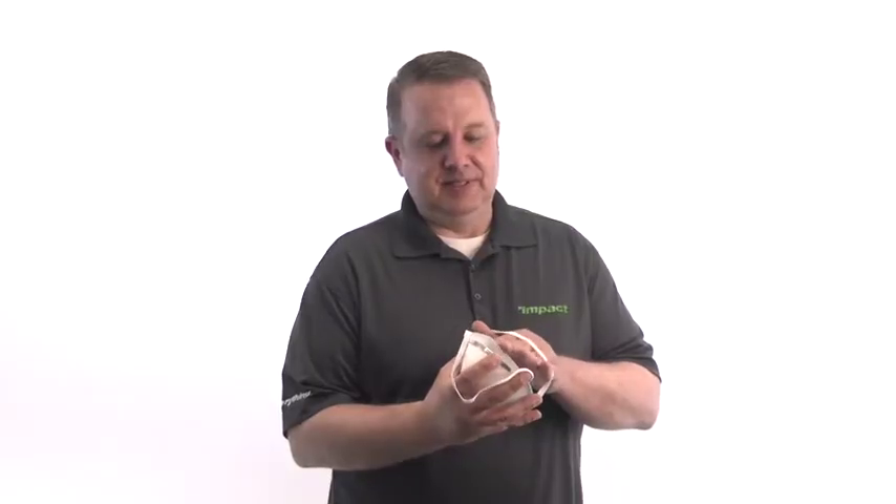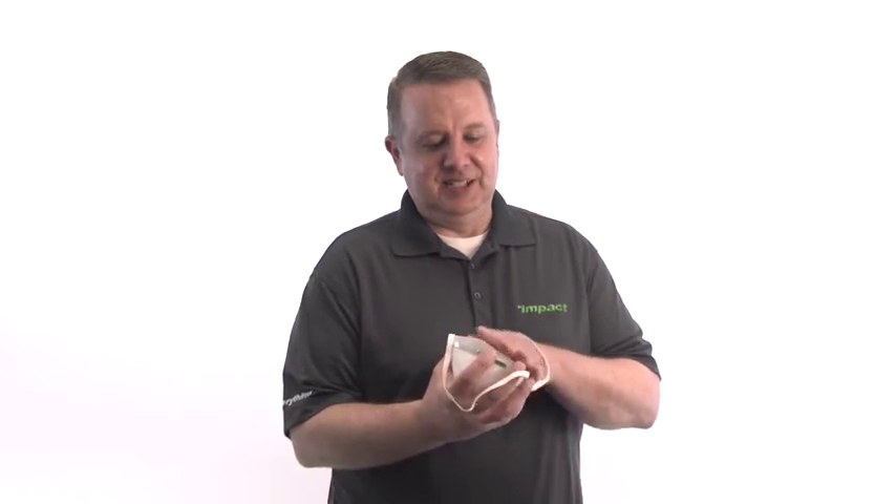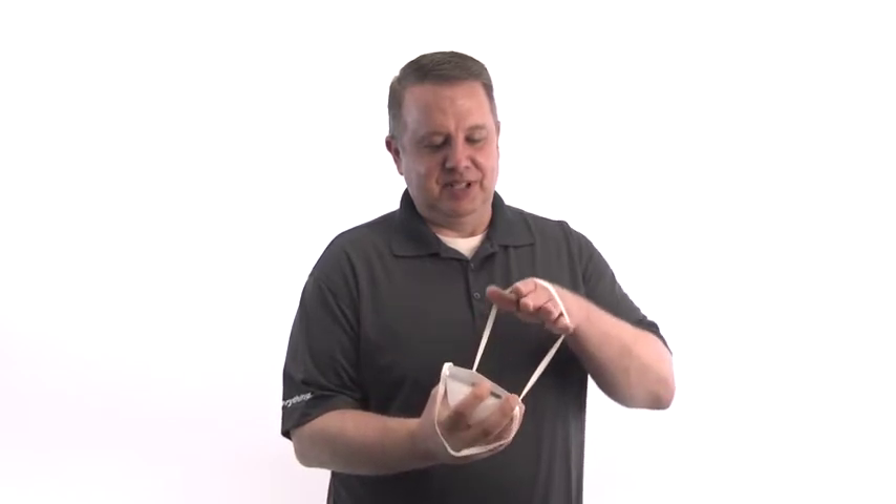Position the respirator in your hands with the nose piece at your fingertips. Cup the respirator in your hand, allowing the headbands to hang below your hand.